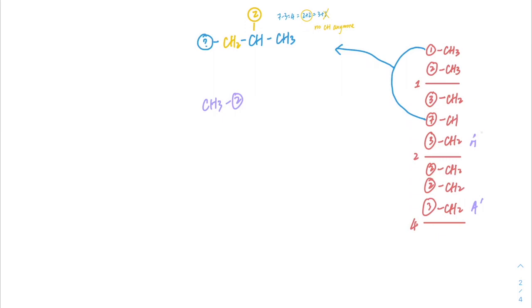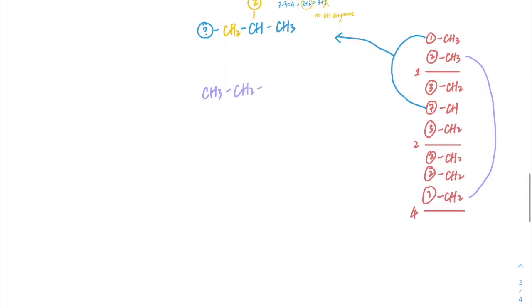Now what we need to do is choose one of them and link it to my methyl group for now. Also because this CH2 only has 3 neighbors, on the other side of this CH2 there should be no hydrogen neighbor. And it's highly likely to be something very electronegative.